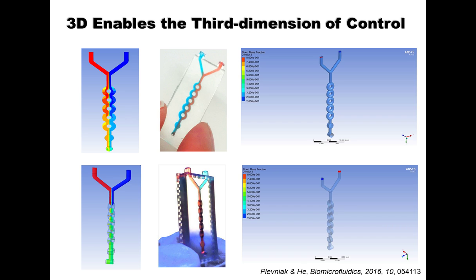So as we demonstrate through this video, the geometry, the scale dimension and the size of the channel are exactly the same, but we only turn the stacking ring 90 degrees against the Y-shaped introduction channel. So there is a change in the third dimension, the Z depth, which actually introduces turbulence into the microfluidic channel and substantially improves the mixing process.